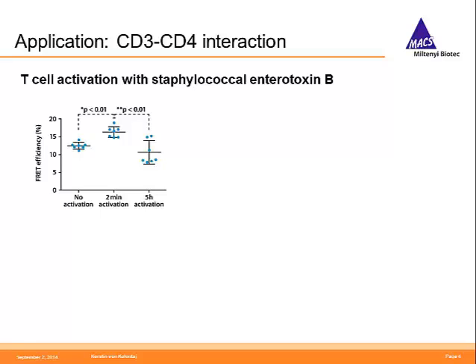And so I knew I could look for an application. In this case, I analyzed the clustering of the CD3 and CD4 receptor on T cells. And I activated my cells with staphylococcal enterotoxin B, which is quite a strong activating toxin.